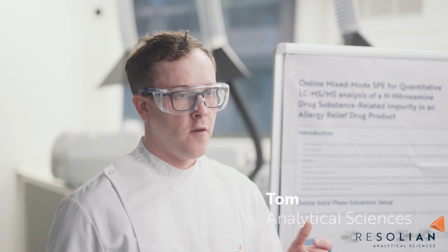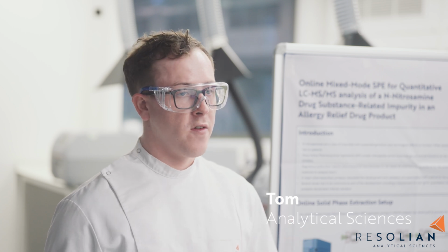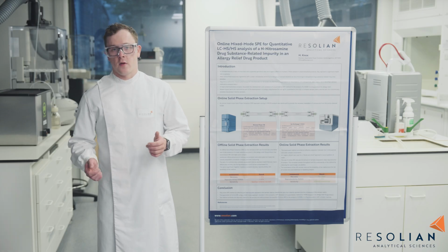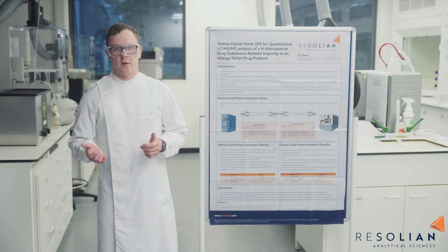Hi, I'm Tom Kershaw. I'm a scientist at Resolian in the Analytical Sciences department, specializing in trace analysis of nitrosamines in pharmaceutical products. A major pharmaceutical company requested the development and validation of a quantitative method for the analysis of an NDSRI, the analyte, in a drug product for allergy relief.